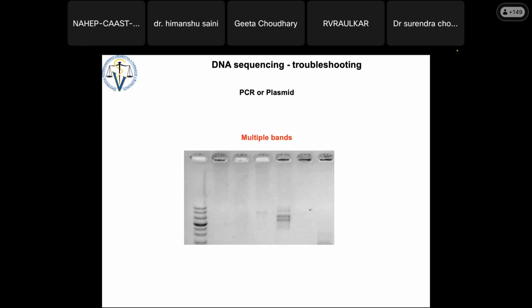I will punch it first. So the gel is here now, and then I have a master mix tube, and I will release this gel, whatever came into that master mix, and I will run the PCR. No interference of all the agarose. If somebody tries, then send me the picture of your result, and you will never be sad with this.